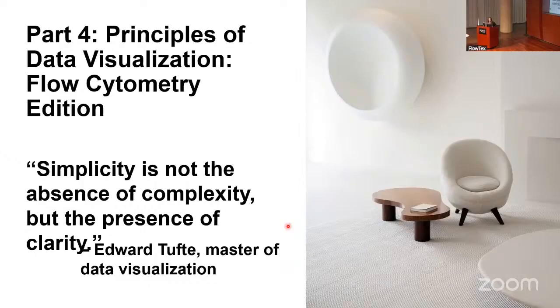Principles of data visualization, flow cytometry edition. So Edward Tufte is a master of data visualization, and he has this quote: "Simplicity is not the absence of complexity, but the presence of clarity." And the idea is that the figure should disappear. You should immediately be able to look at a figure and figure out what the point is. What am I trying to say to you? And so in this example, this is Kim Kardashian's house, and you can immediately see that the point is to sit in this chair and read this book. There is no ambiguity. So be a Kim.